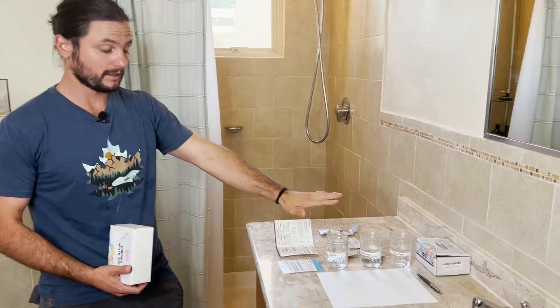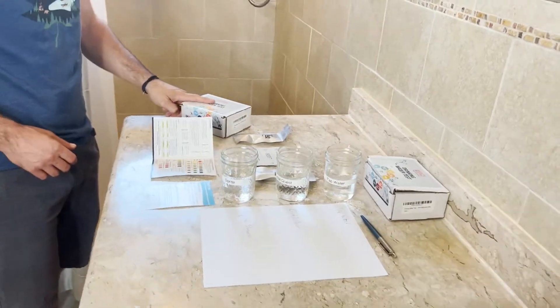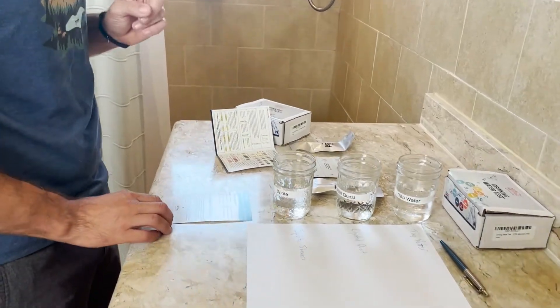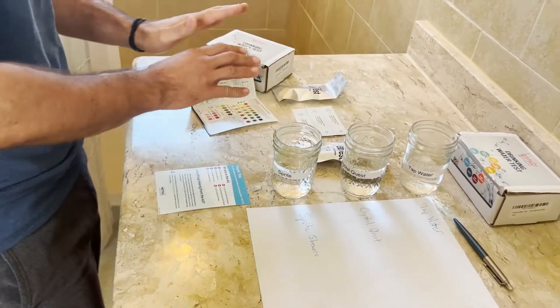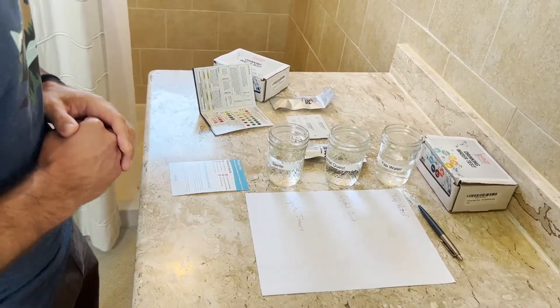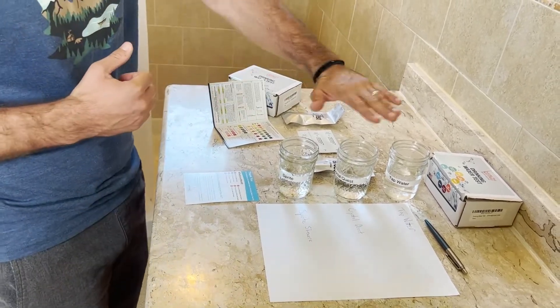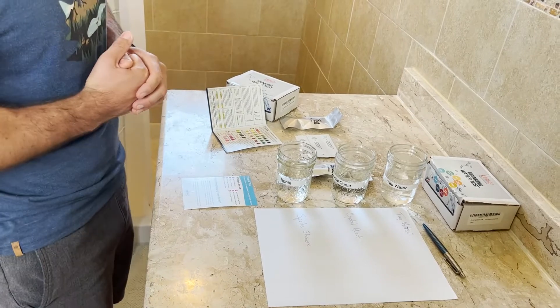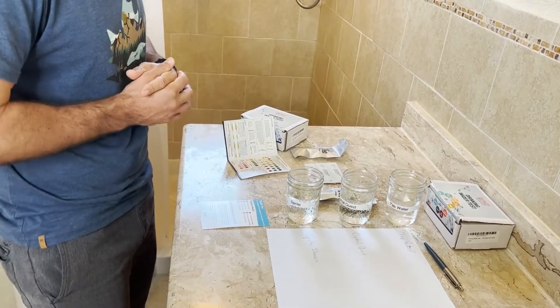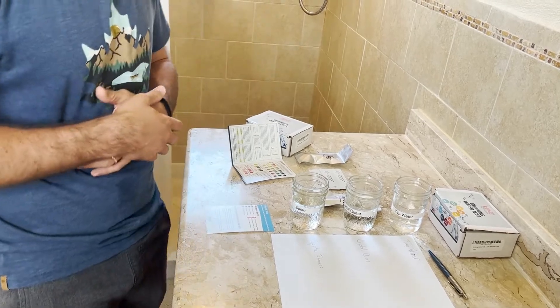You can see over here we have our samples all lined up. This test kit comes with a variety of tests: one lead test kit — I bought two because we're doing lead on two water sources — one copper test and one bacteria test, which we're not doing. And then two chlorine tests per box. We have three samples, so we'll do three chlorine tests. They also have two nitrate and two three-way test packets that test alkalinity, total hardness, and chlorine.